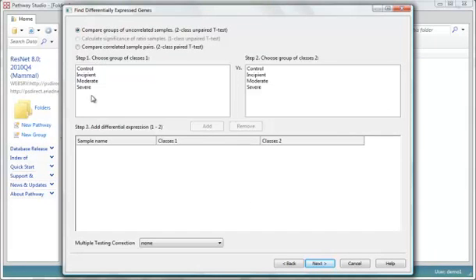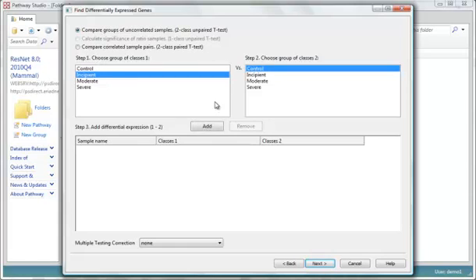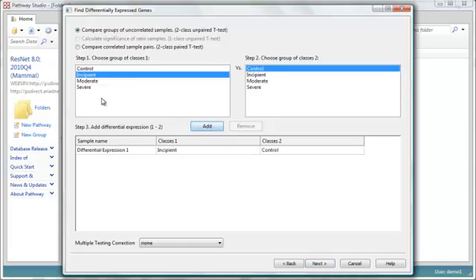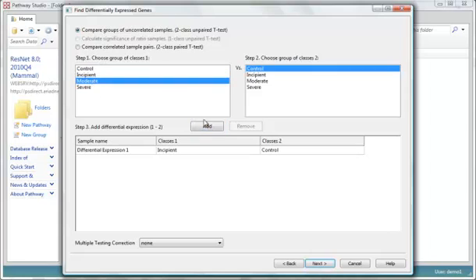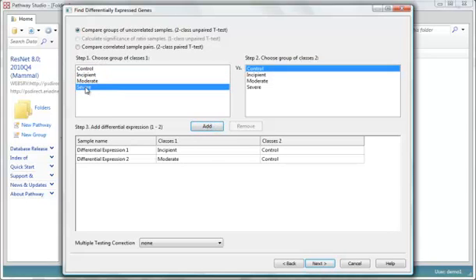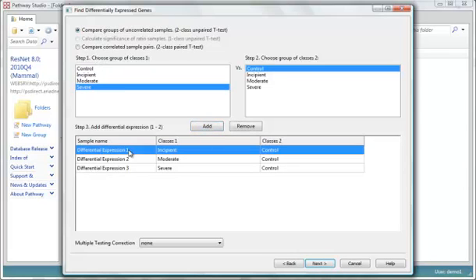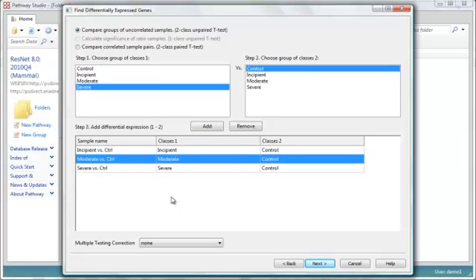Now I'm ready to prepare my comparison sets. I want to compare the incipient versus control, and I'll add that first. And I want to compare the moderate versus control, I'll do that next. And the severe versus control. You can set up pretty much as many comparisons as you want. So now I'm going to give them names so I can find them in the program. You can apply multiple testing correction here.